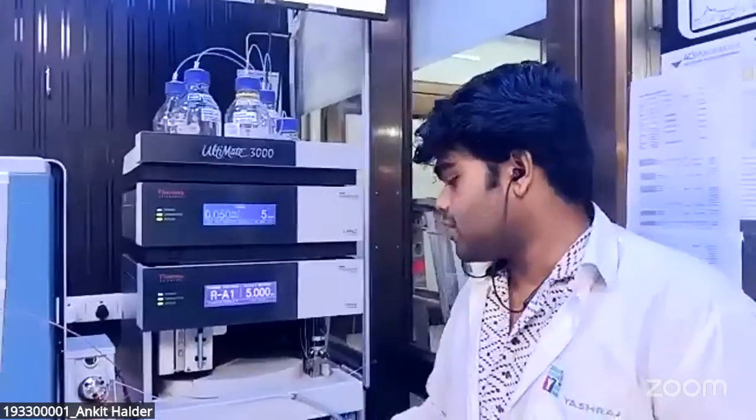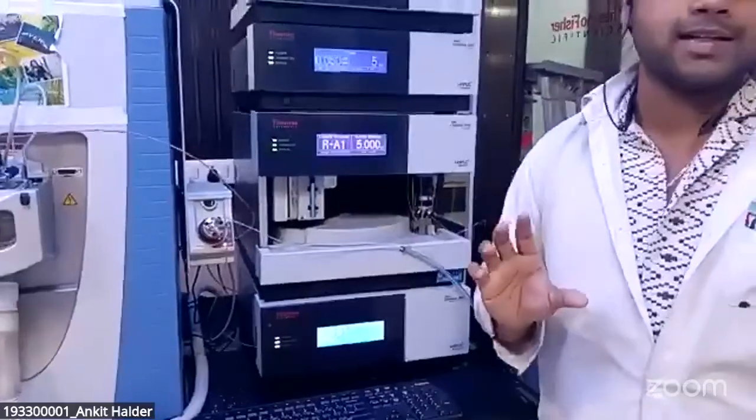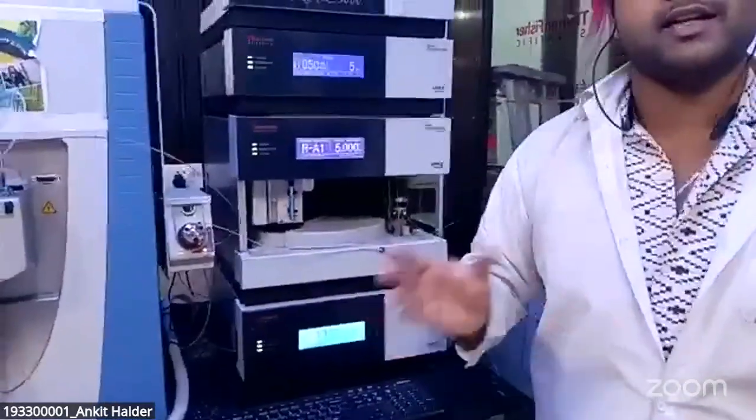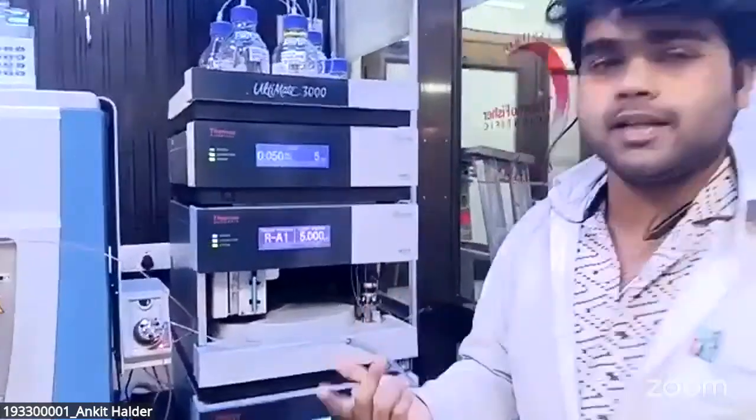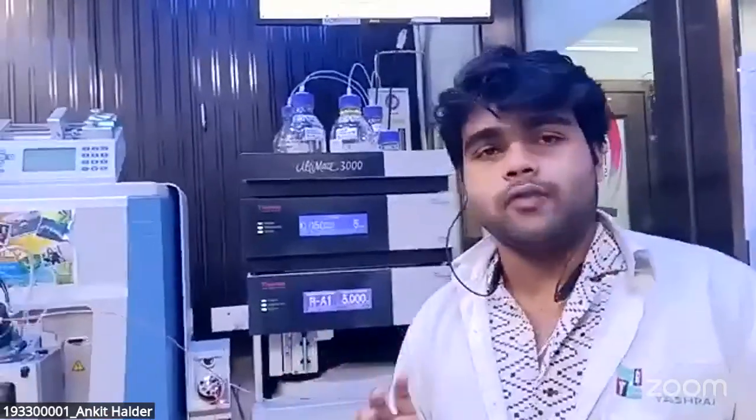So for good coverage, and to ensure there is no RT shift of the metabolites or lipids that you are going to see, you should not compromise on the temperature. This component keeps the ambient temperature at 40 degrees Celsius, and it makes sure that there is no fluctuation in the ambient temperature. So for the functioning of these columns, the column compartment keeps the temperature at 40 degrees Celsius.